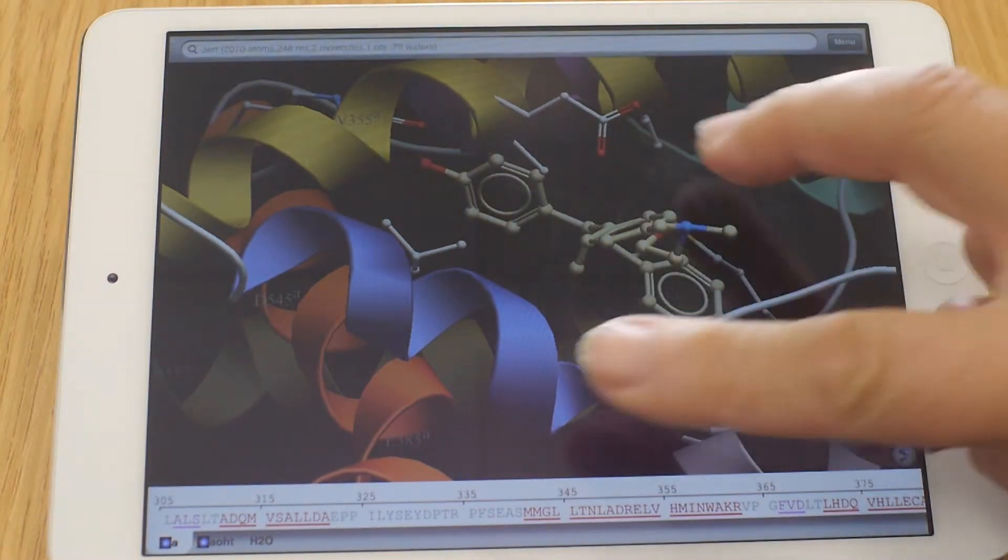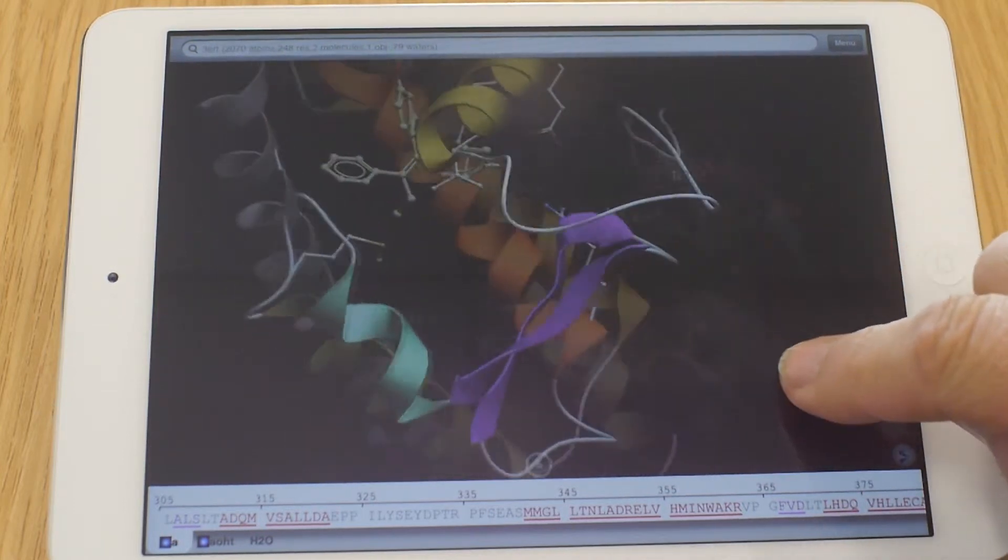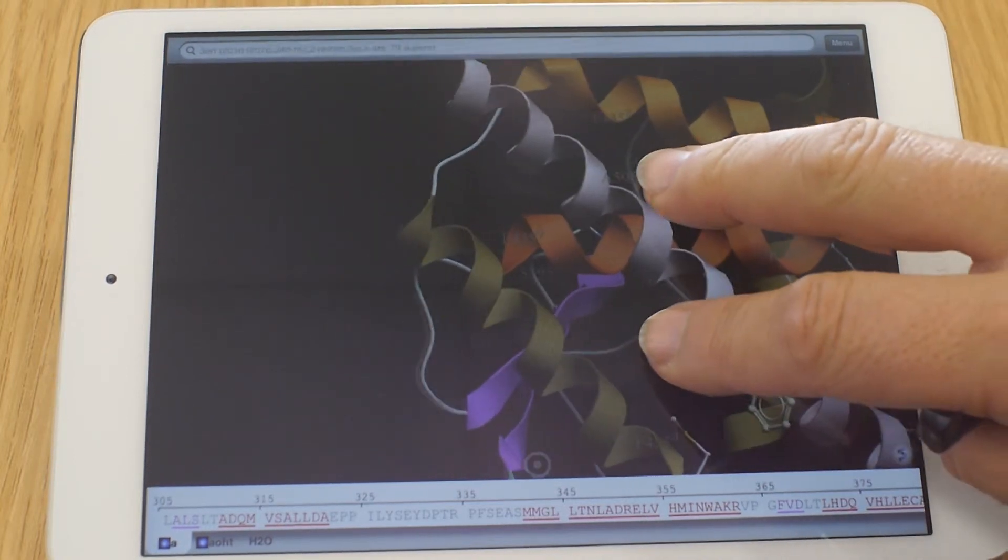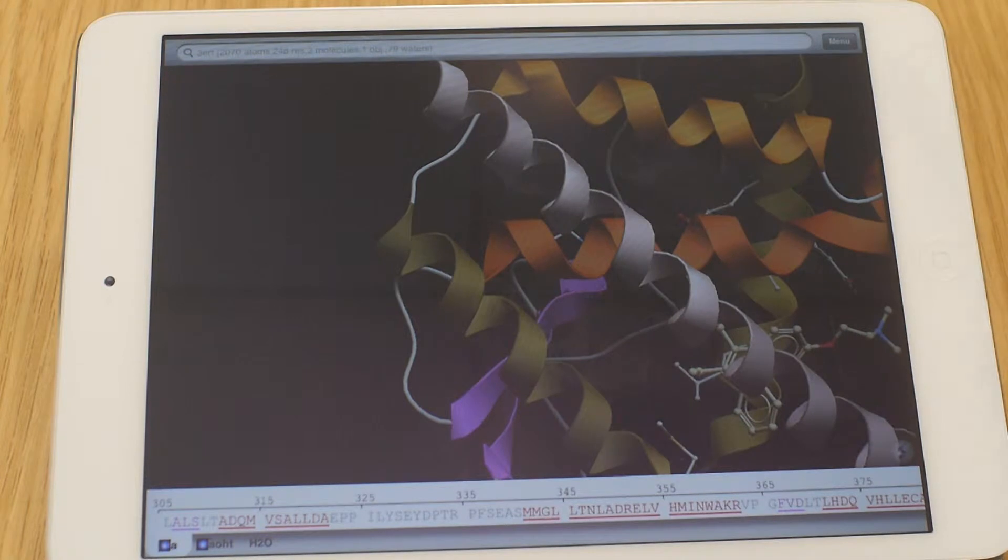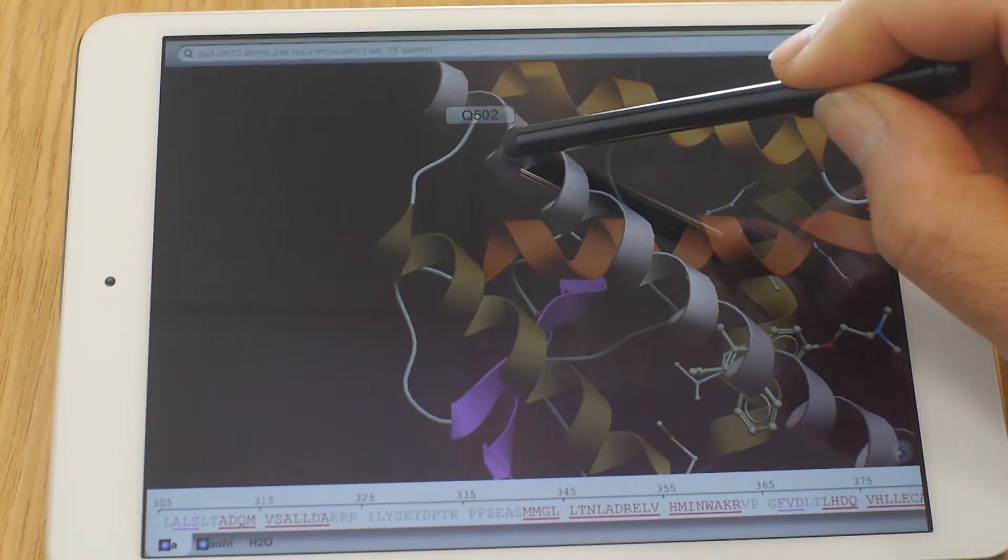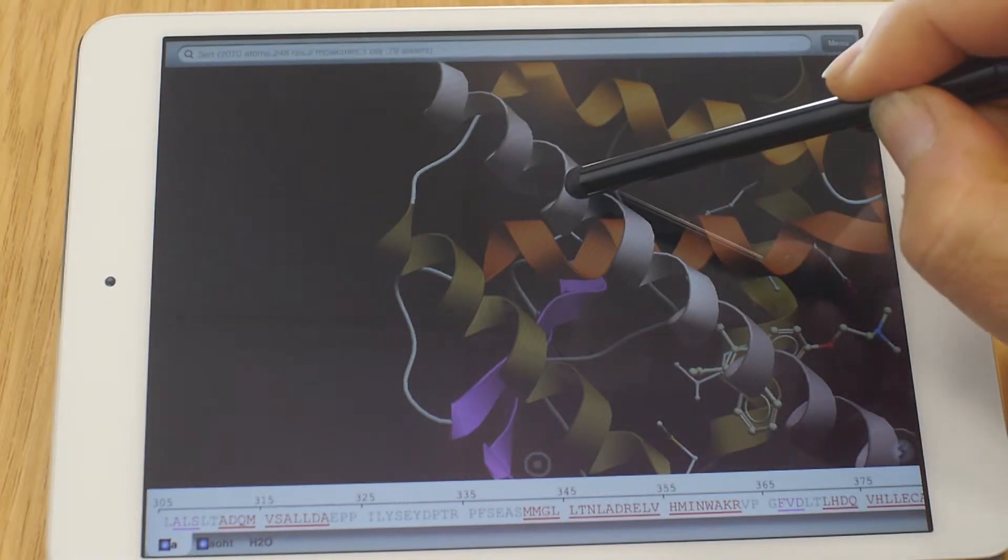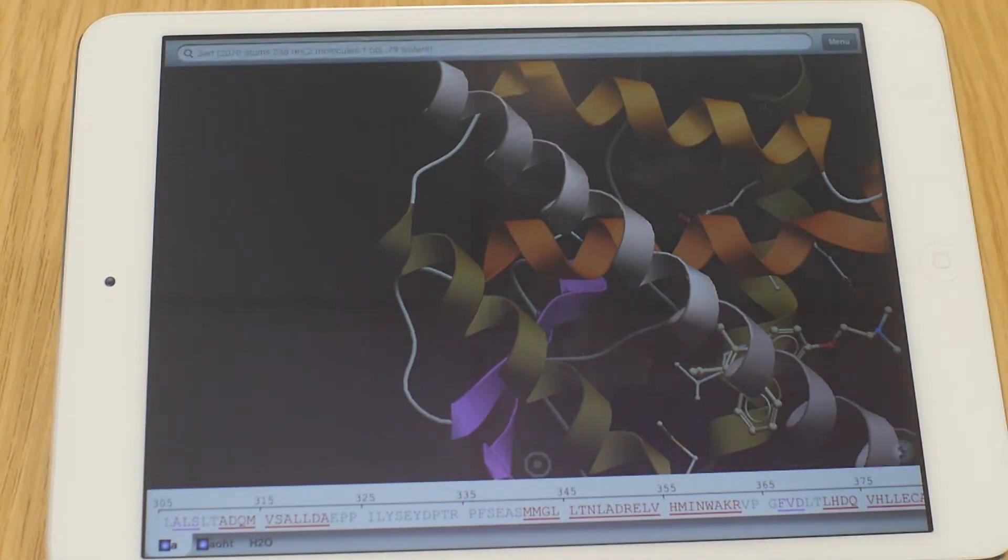We can label the residues. That might be helpful if you're lost. If you don't know where you are in the protein. But there's also another way to label the residues. Go back in the menu. And get rid of the residues. All you have to do is click on one residue and hold it clicked. And then it pops up. Yes, this is alanine 505 in this case. So if you don't know where you are in the molecule, click on it, hold it for a couple of seconds, and it shows you where you are.